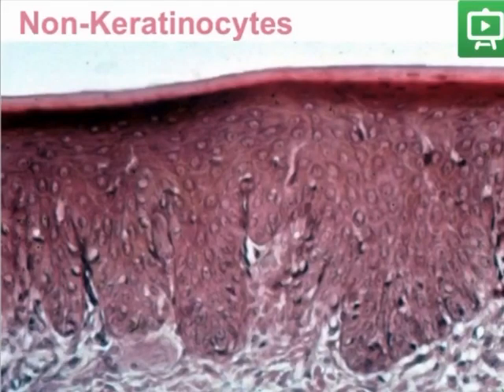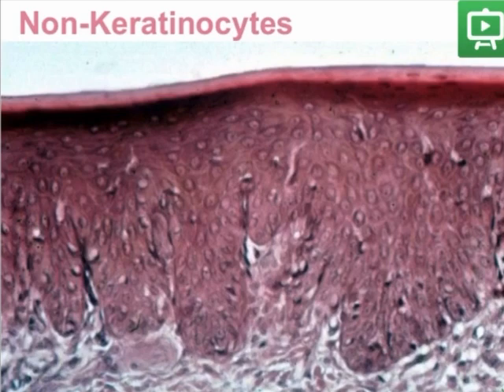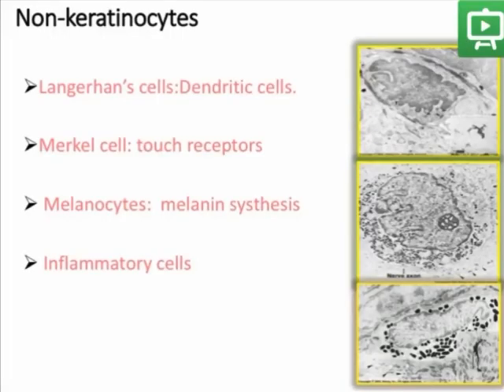The non-keratinocytes are cells which compose only 10% of the epithelium. They are uniquely clear cells under the microscope, as you can see here. All cells that are clear can be non-keratinocytes. These cells can be Langerhans cells, Merkel cells which are touch receptors, melanocytes which synthesize the melanin pigment, or inflammatory cells such as lymphocytes.